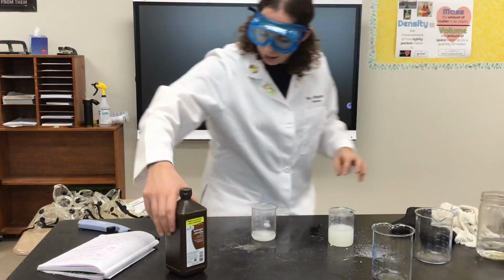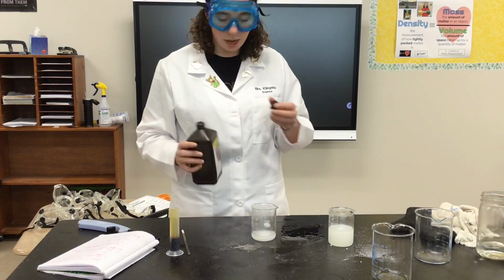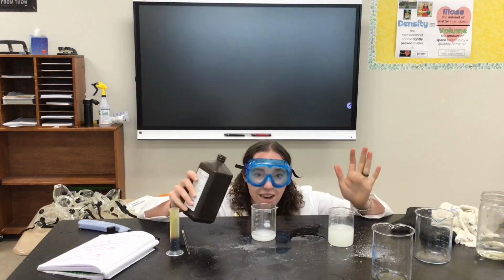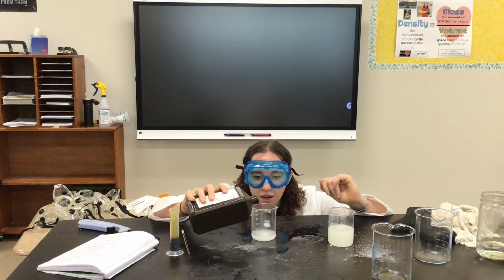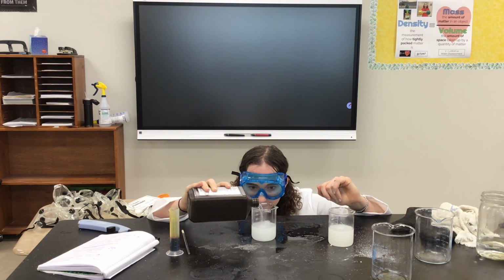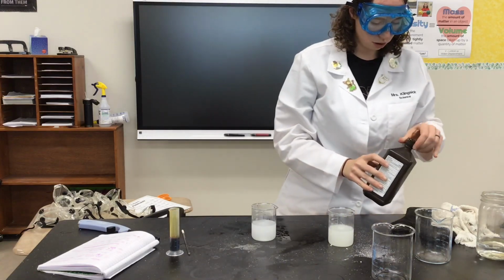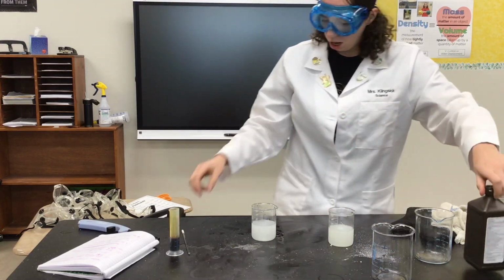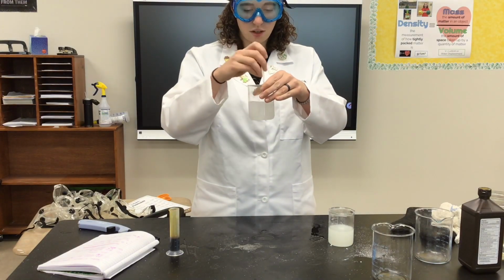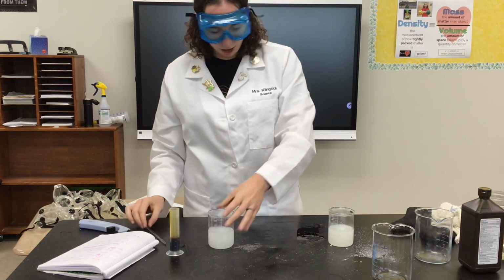And then I'm going to add in 100 milliliters of hydrogen peroxide. Again, that's H2O2. All right, so I've already added in 40, so now I'm going to add 100, so I should get to 140. Right there. Okay. And again, no bubbles, no real reactions, nothing that lets me know a chemical change has happened. We'll just have that mixture now.